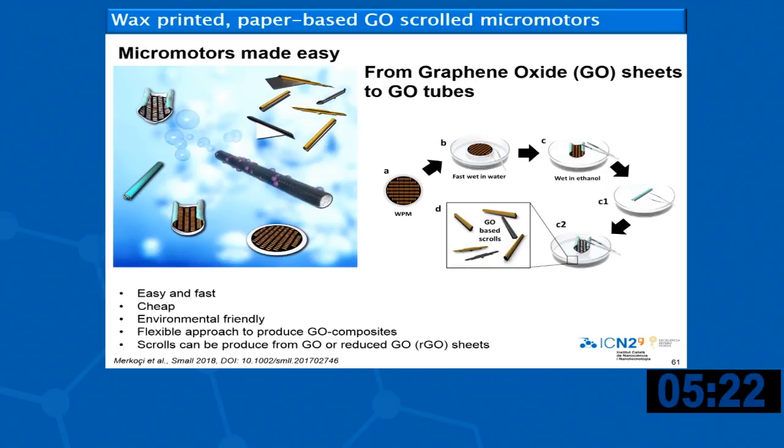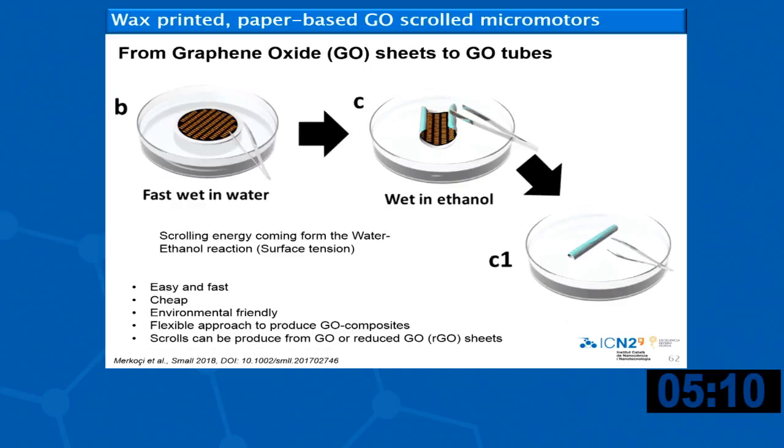So we thought, why use this technology and not a very simple one? So we now stamp the motors by using this stamping of graphene. And this is really very interesting. We are preparing this wax printed membrane. We filter graphene on top of this, and after that we release this graphene by putting it in contact with ethanol.